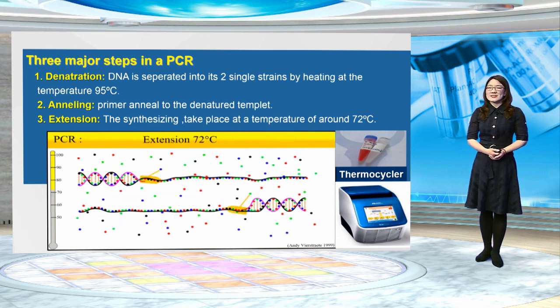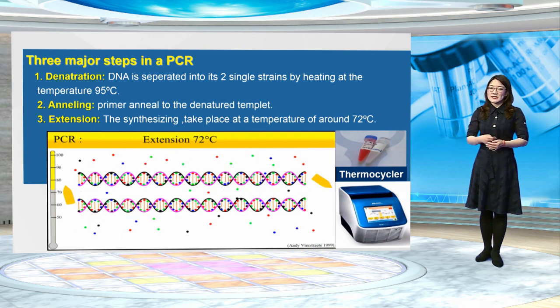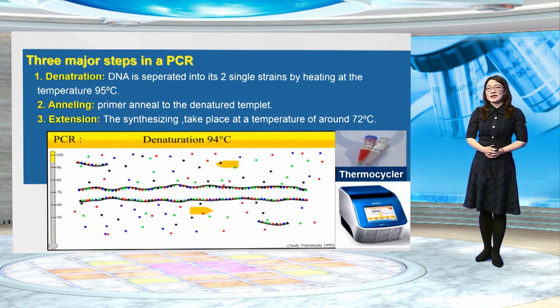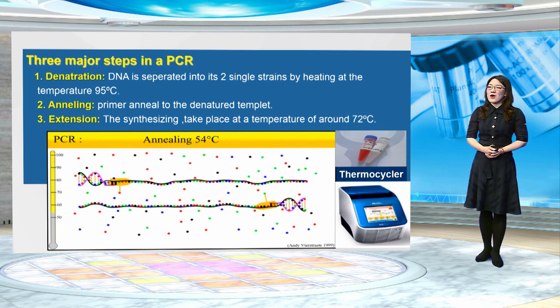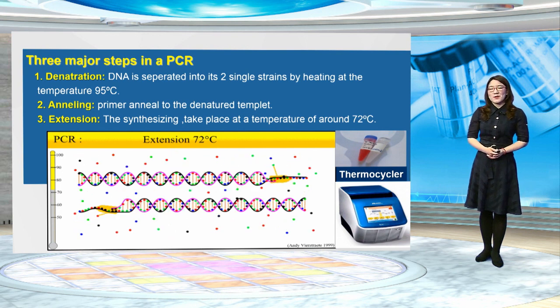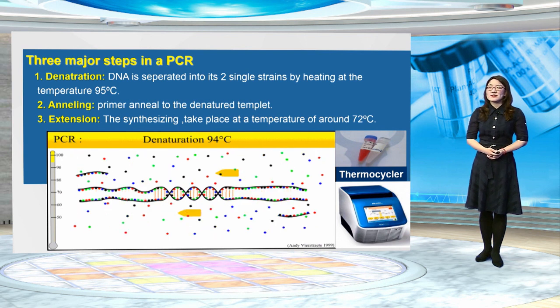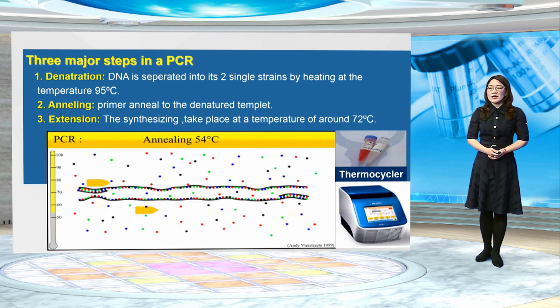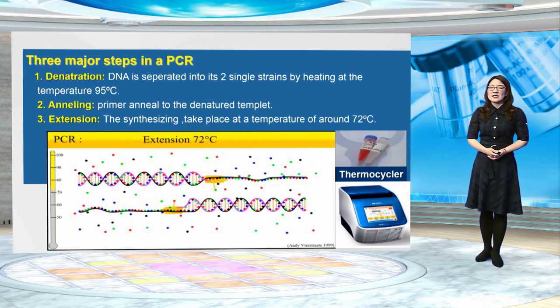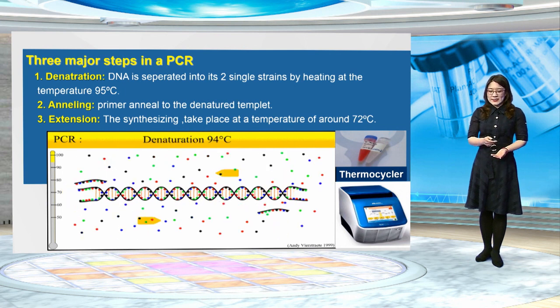The final result is that only the DNA sequence located between the 2 primers is eventually synthesized. Theoretically, after 30 cycles, 1 billion copies of the target region on the DNA template have been generated. This PCR product, sometimes referred to as an amplicon, is then in sufficient quantity and quality, that is, can be easily measured by a variety of techniques.